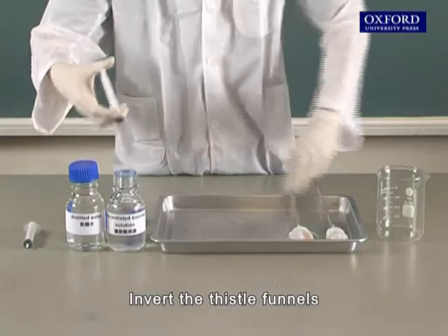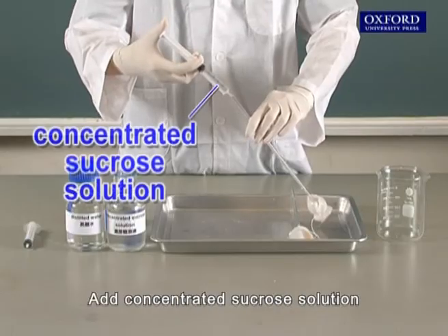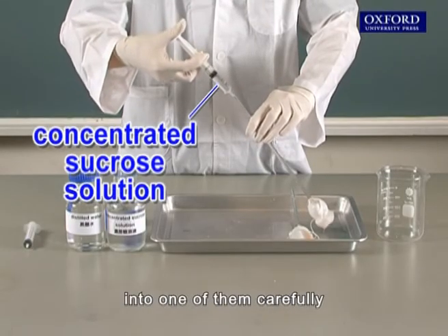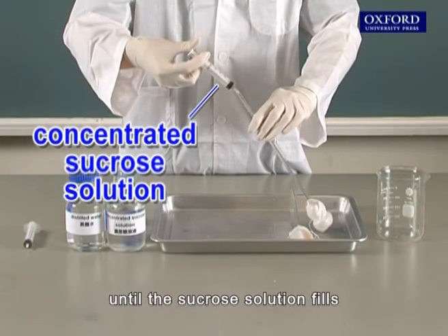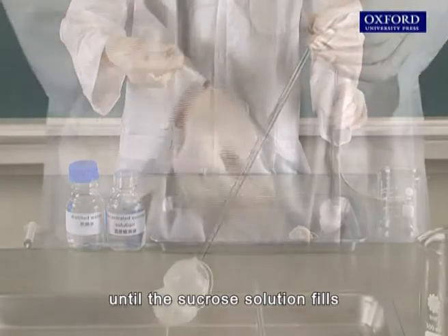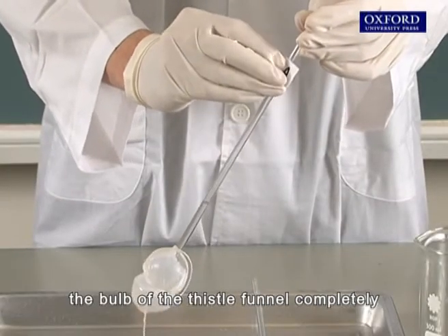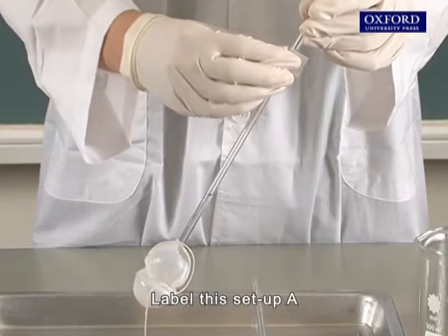Invert the thistle funnels. Add concentrated sucrose solution into one of them carefully until the sucrose solution fills the bulb of the thistle funnel completely. Label this setup A.